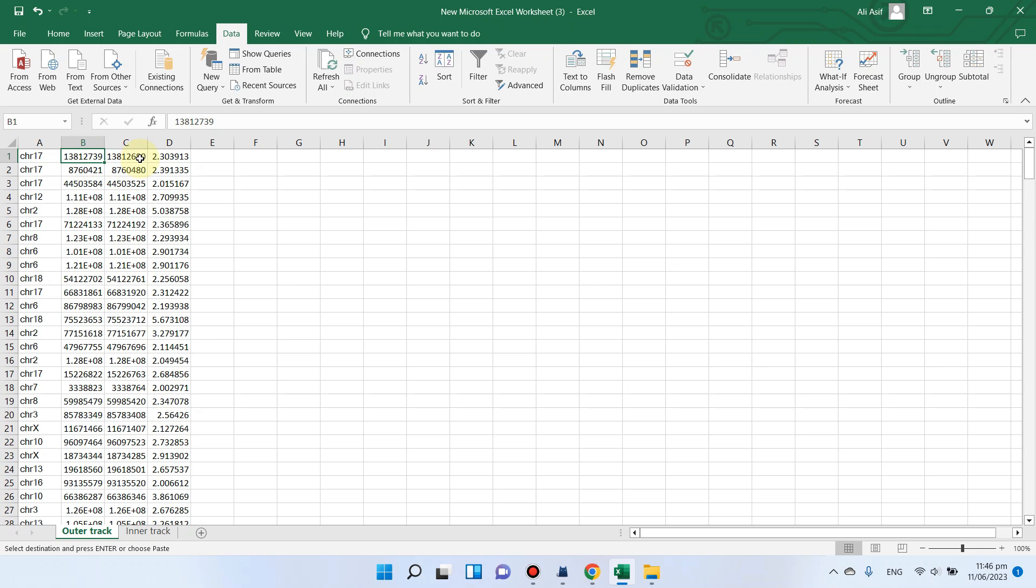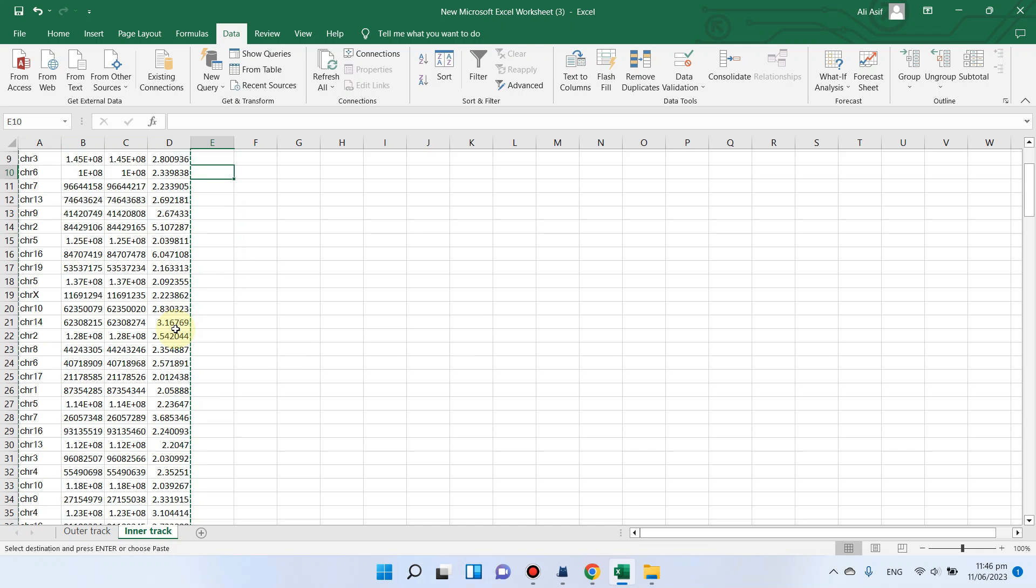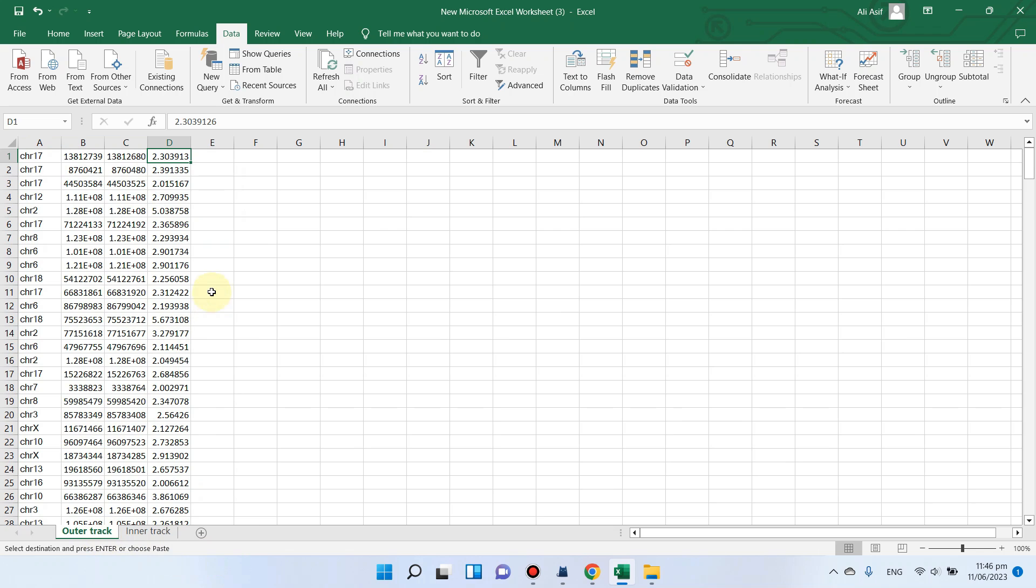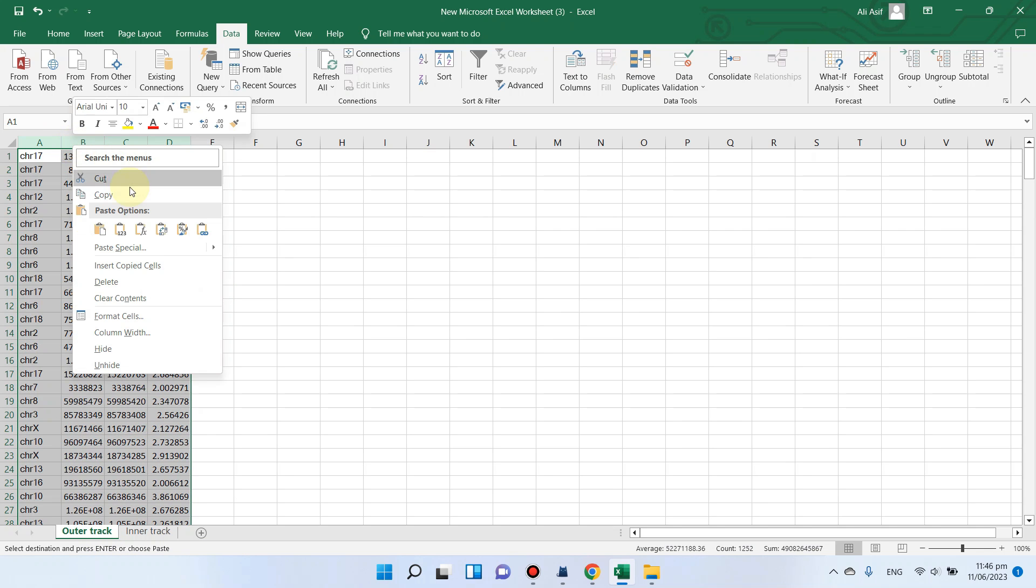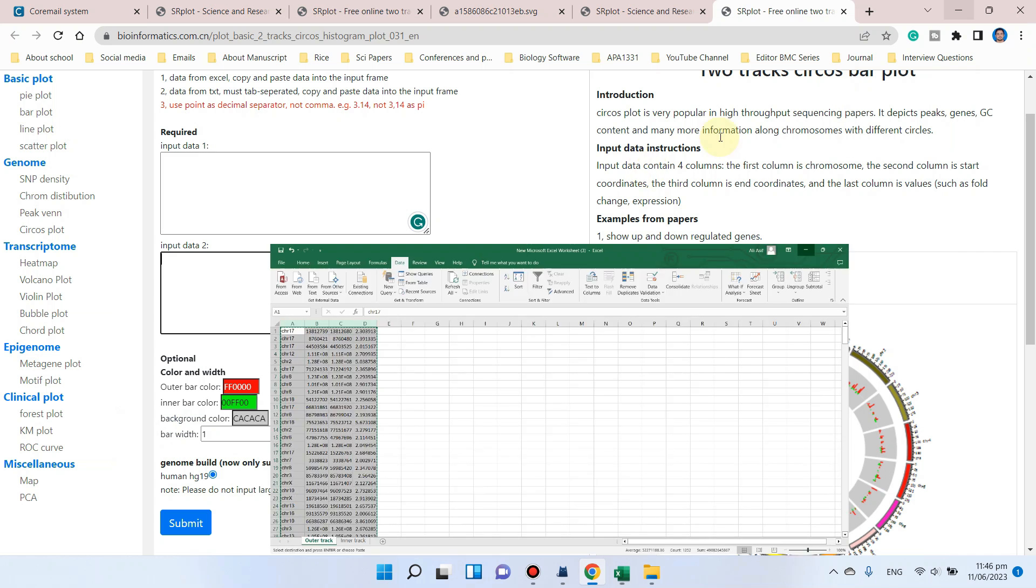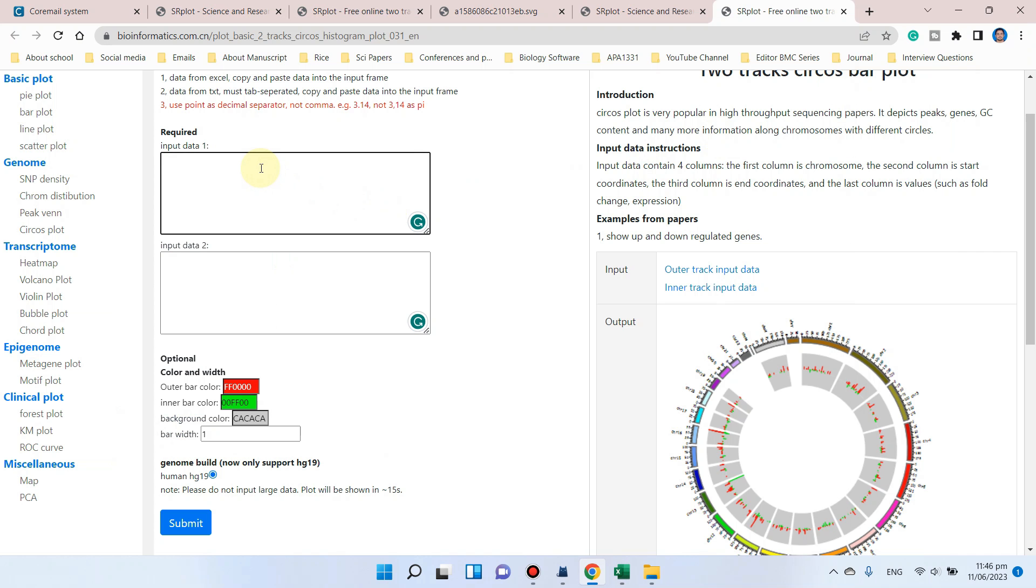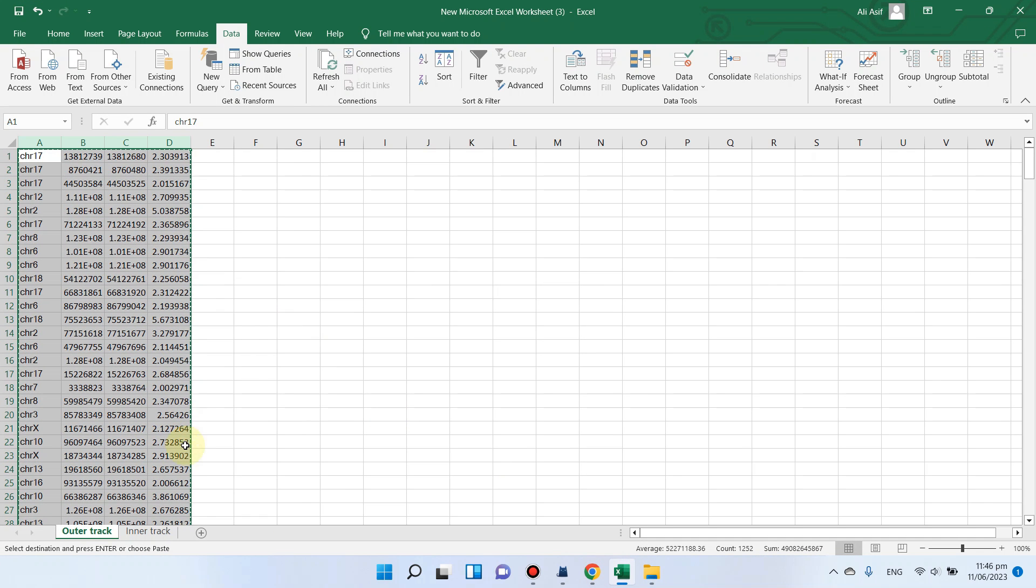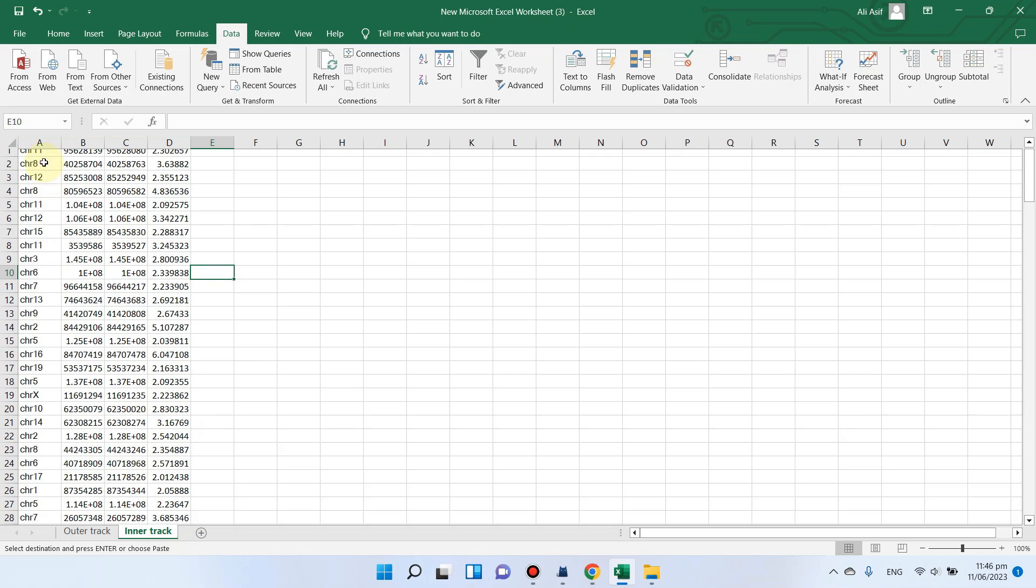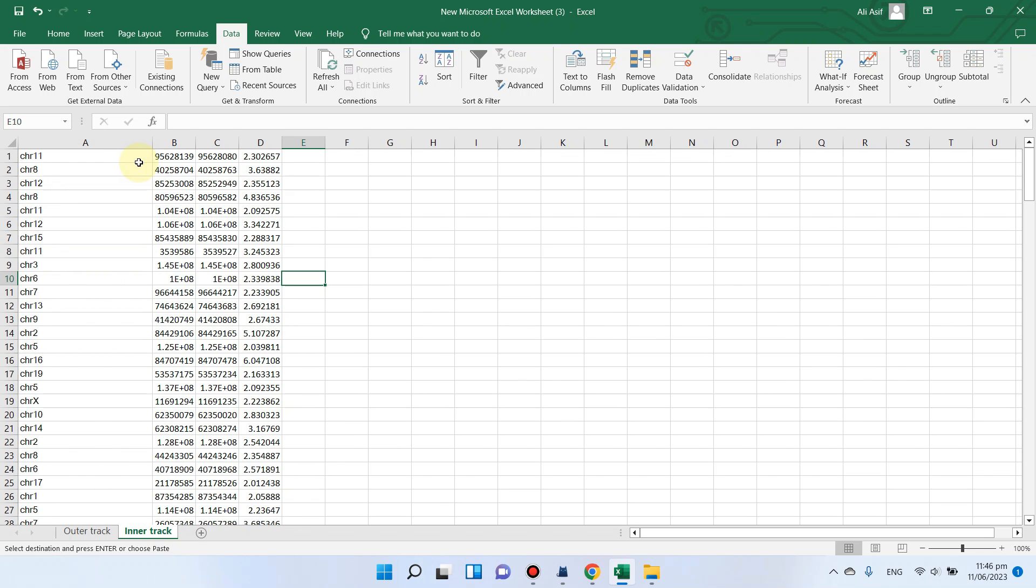Starting position, ending position, and fold change for outer track and inner track. Now if you want to draw a relationship between these two, you can simply go here and copy this data and paste the outer track into the first box, and similarly, the inner track information into the second box.